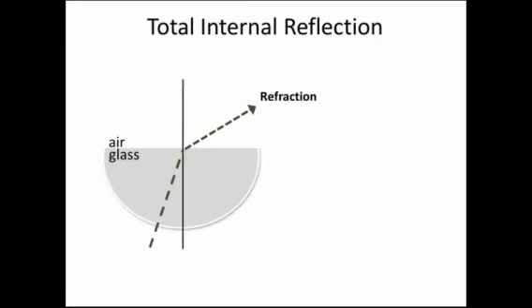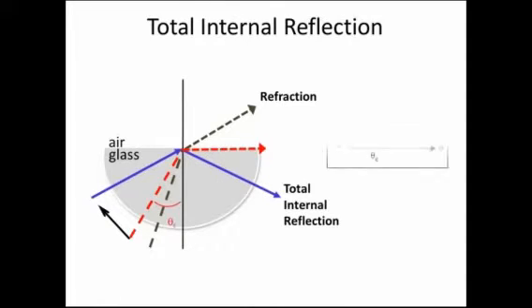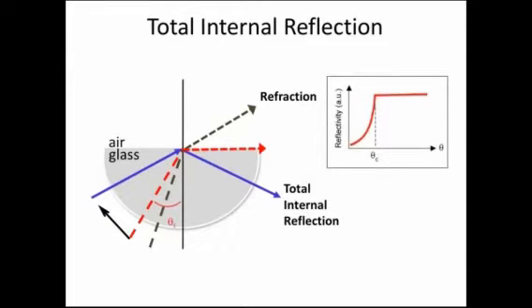Before discussing surface plasmon resonance, I need to introduce the concept of total internal reflection. So when you have a light beam hitting a prism, the light is bent towards the plane of the interface when it's passing from a denser medium, being here the glass, to a less dense one, which is present here as the air. This is known as refraction. Changing the incident angle changes the outcoming light until the critical angle is reached. At this point, all the incoming light is reflected within the prism. This is called total internal reflection. So the light cannot exit the medium and is effectively trapped in the denser medium.